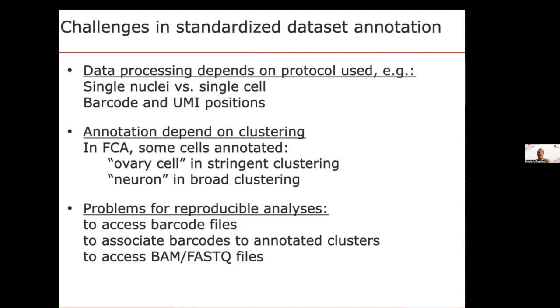When you go on Bgee and download the data — we'll show you how after the break — the data have already been annotated. For each cell, you will find the barcode and the cell type annotation in a very consistent, reproducible format.